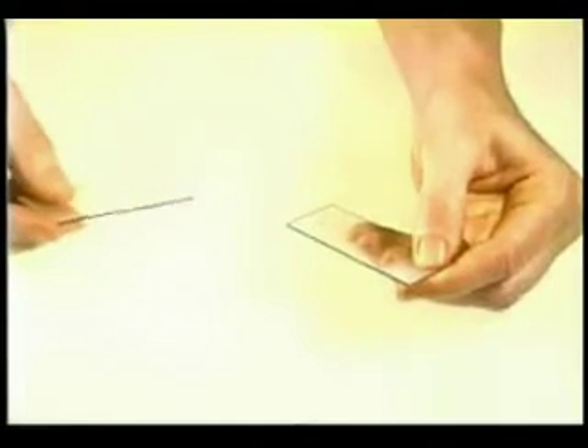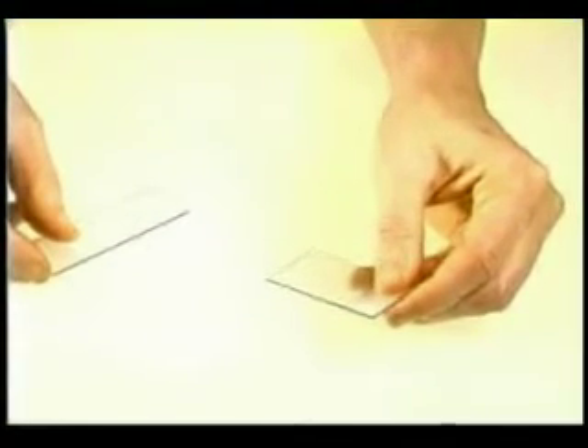throughout the smearing, and the pressure should be light — just enough to spread the cells. The finished smear should have an oval configuration with even thickness, and virtually all the material will end up on the bottom slide.